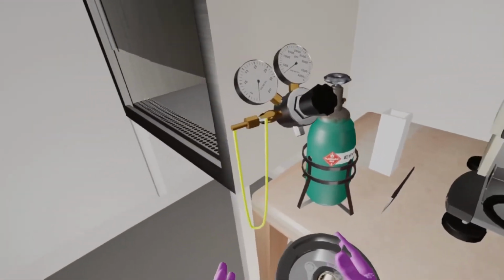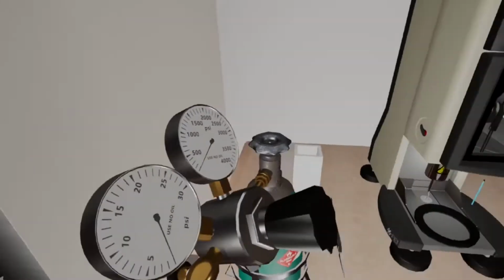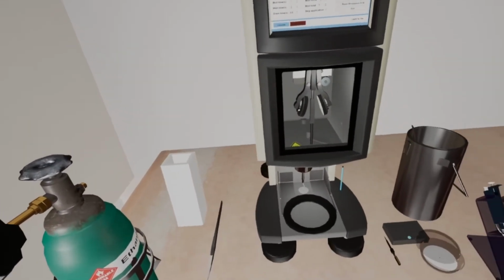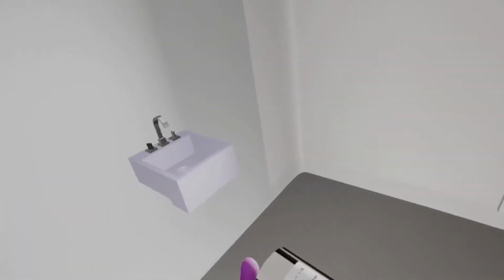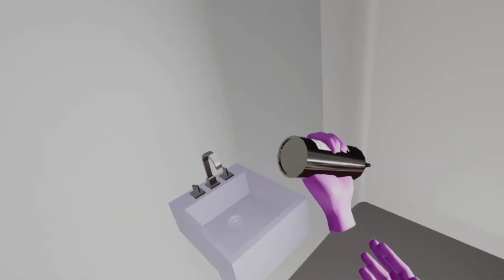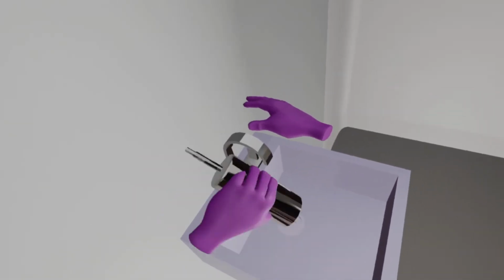Okay, put the workstation back into the hood. Remove and empty the humidifier. Invert and dump humidifier at least 3 times to clear reservoir. Place the humidifier upside down in a styrofoam container for storage.